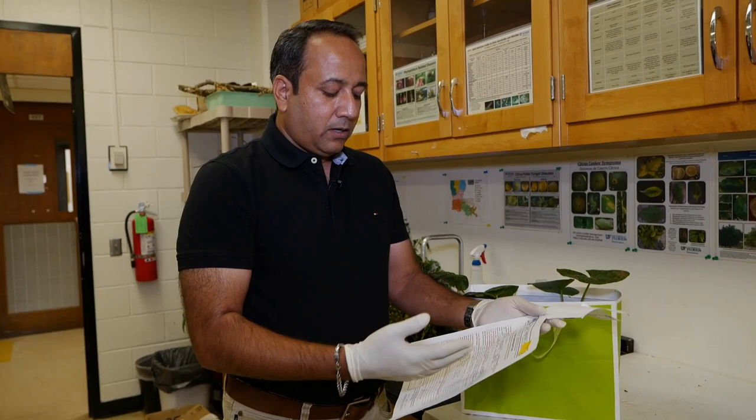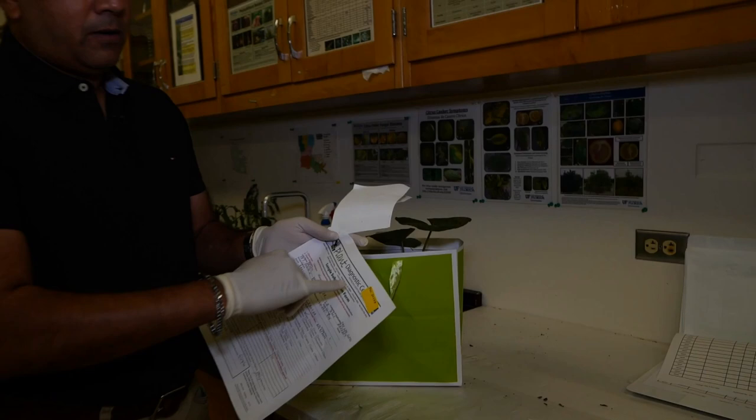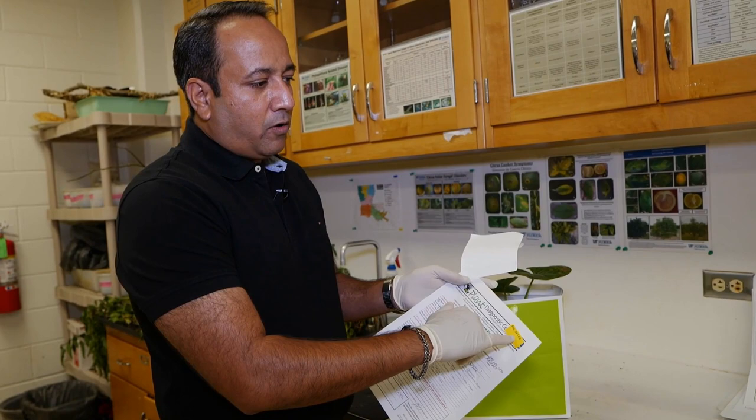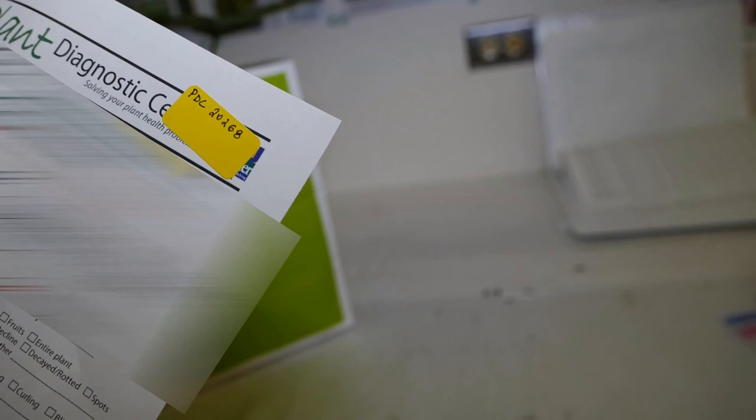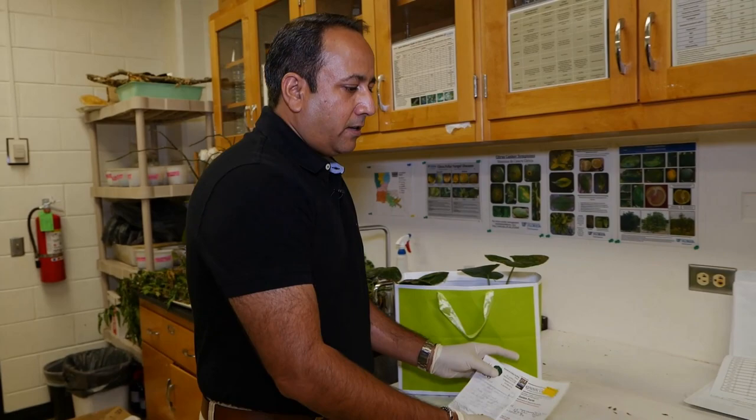When a sample comes in, we log it with a number, a unique number that will stay permanently with this sample for the time period we keep our records. It's just a five-digit number - the first two digits are the year and the last three digits are the sample number. You can see even with COVID-19 we are at 268 samples this year. Generally at this point of the year, June-July, we are hitting about 500 to 600 samples, but because of COVID-19 shutdown we didn't receive that many samples.